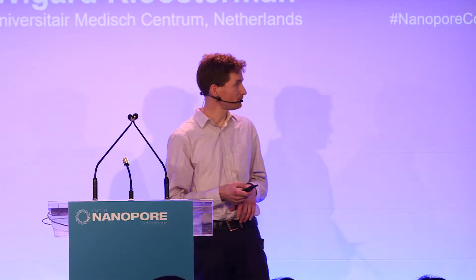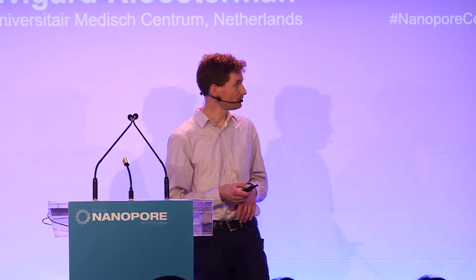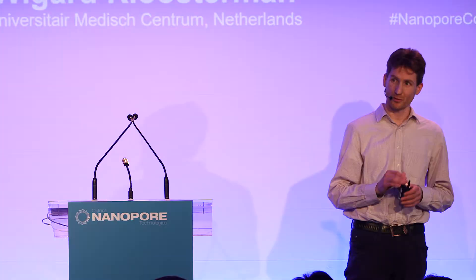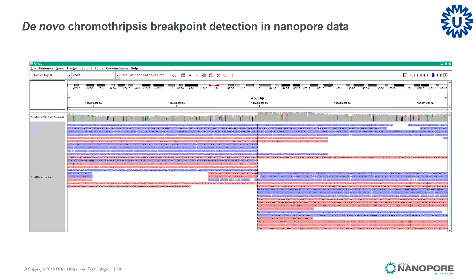This is a nice screenshot of one of these chromothripsis breakpoints — there were 40 in total in this patient. You can nicely see where the reads are split-mapped, and this is really the breakpoint position. The reads coming from this end and also from the other end — because it's a double-stranded DNA break — are then fused to other segments in the genome.